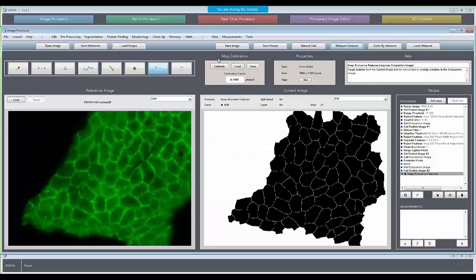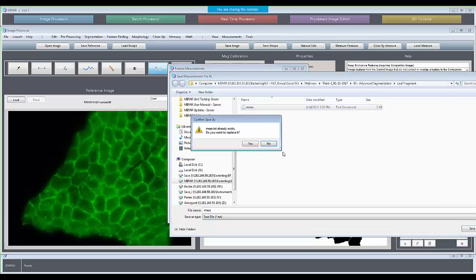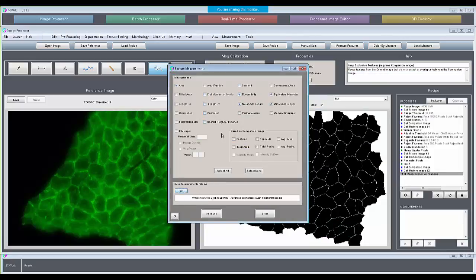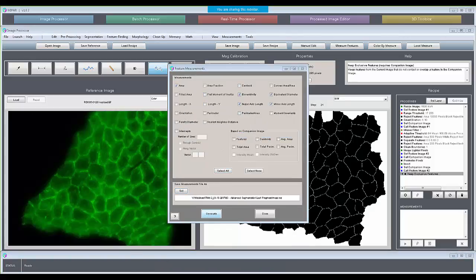If you're heading out, feel free. I'm not trying to keep you here. Let's add those to the list. Let's do area, eccentricity, diameter, major and minor axis length. But you're correct. I think a direct aspect ratio box, even though it's kind of overlapping with eccentricity, would be nice.